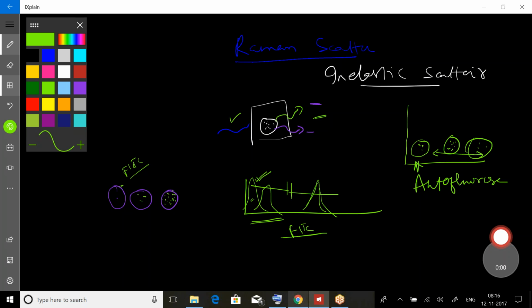In any of the scenarios, we see the difference in the light we are measuring, be it scatter or fluorescence. To summarize, in scatter we collect light of the same wavelength, that is the incident wavelength, and in fluorescence we collect light that is higher in wavelength and lower in energy.